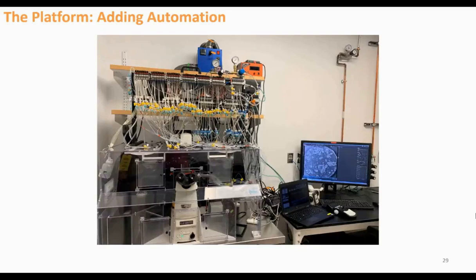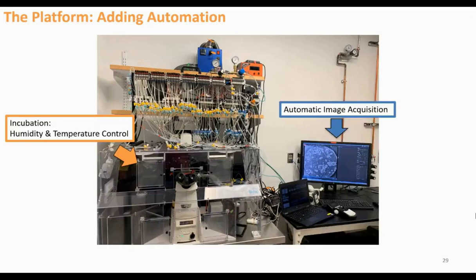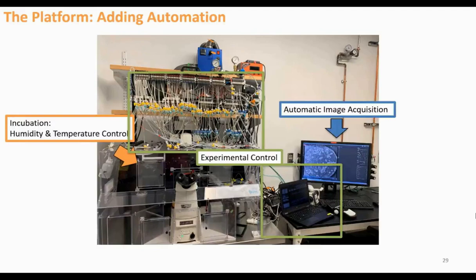Now that we have our home for our organoids, we needed to design a system to automatically provide growth nutrients and experimental stimulants. Here's an example of a typical microfluidic setup. First, we have our built-in incubator to keep our organoids alive and happy for the entire duration — I've done experiments for over two weeks with the organoids happy the entire time. We also have automatic and programmable image acquisition, and then the main part of the microfluidic system: experimental control. This is controlled by a separate computer connected to an array of solenoid valves that control the movement of fluids through a pressurized valve system — what we call microfluidic valves.